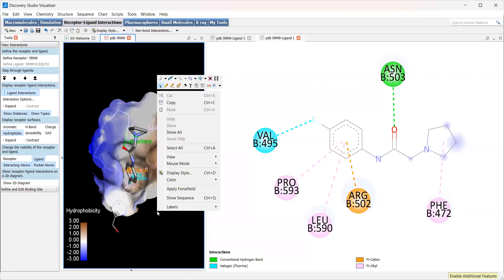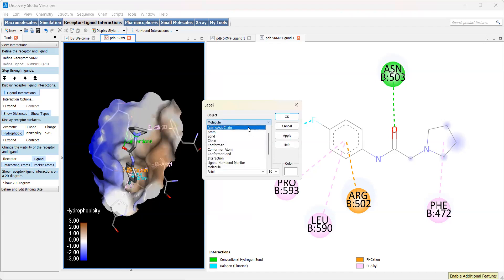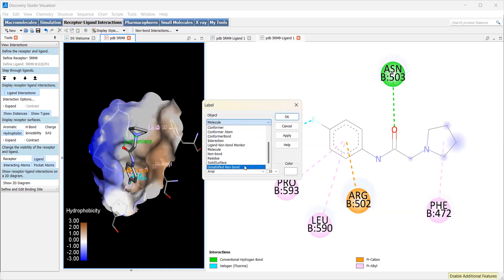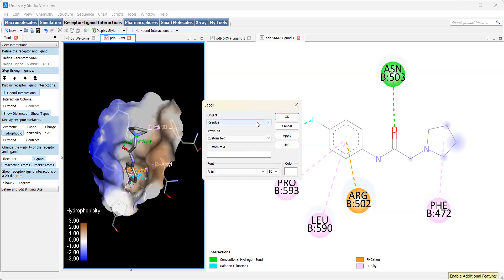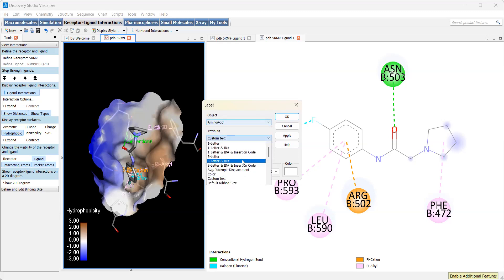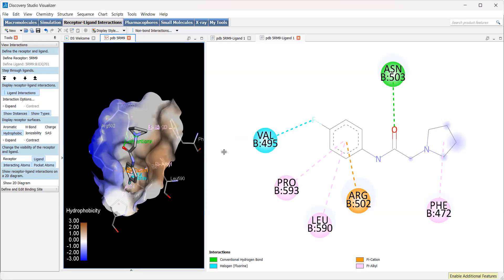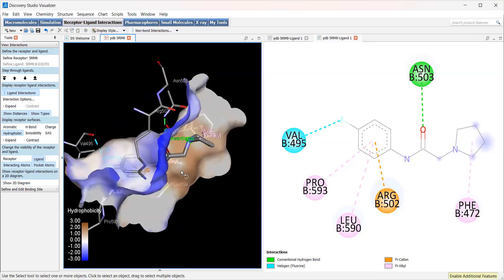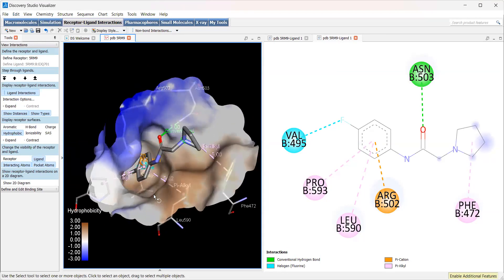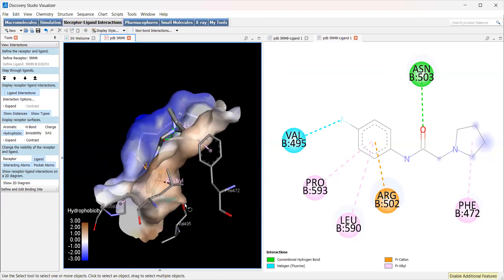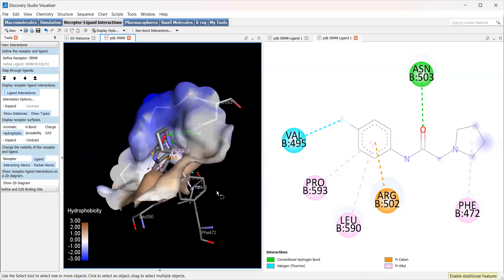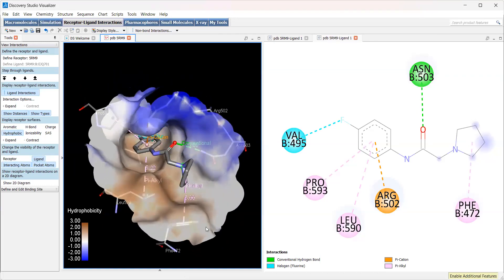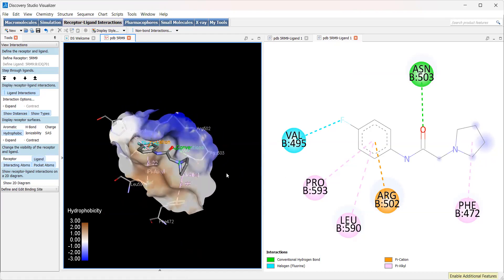We can also add labels. For example, we can add our amino acids. This will give us the labeling of these residues that are interacting. For example, we have proline 593, leucine 590, phenylalanine 472, arginine 502, etc. This is just a 3D version of the 2D diagram we're looking at on the right here.